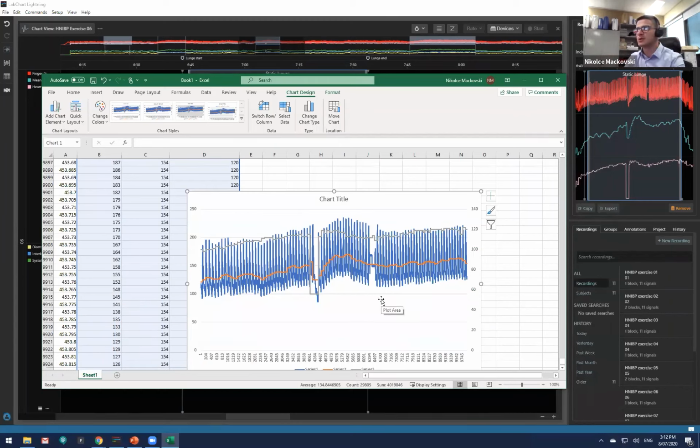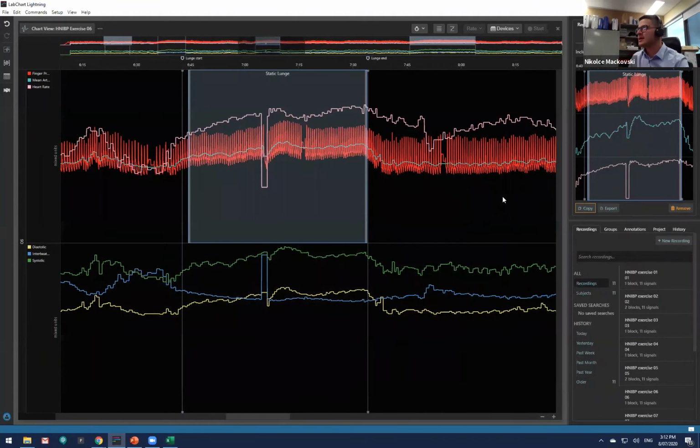And then of course you can just add little comments, modify your axes and tables. It's a really simple way of doing it. So it's a really easy, convenient way to put this together for people to present their data.